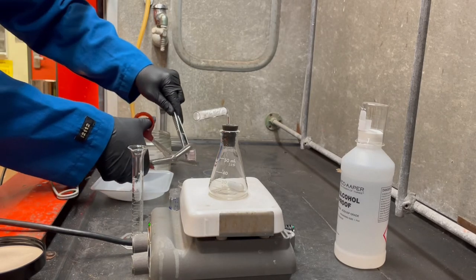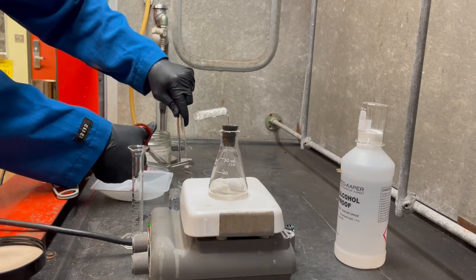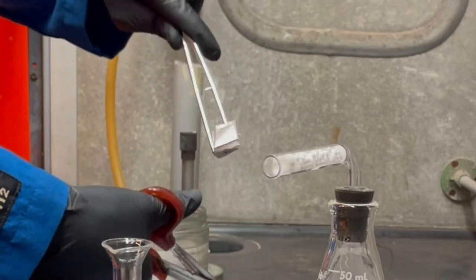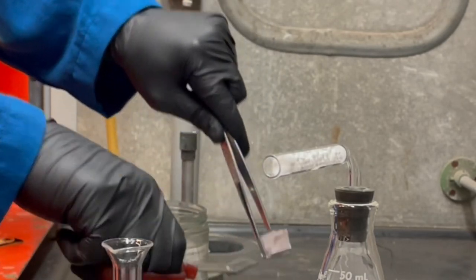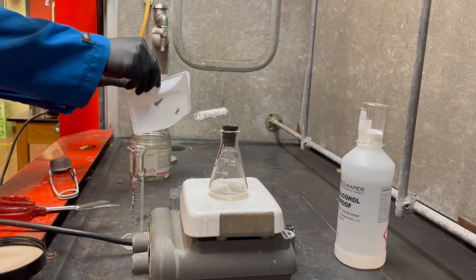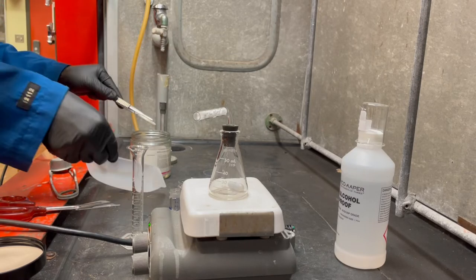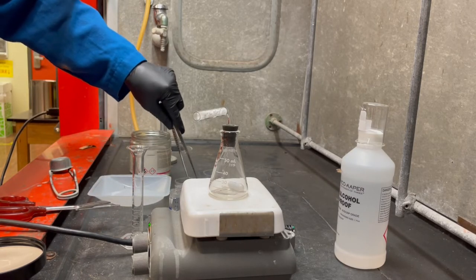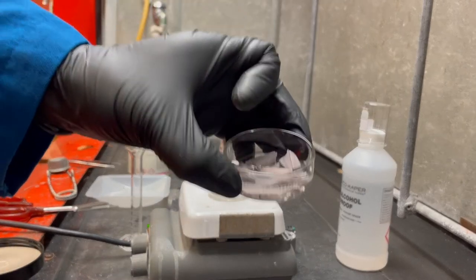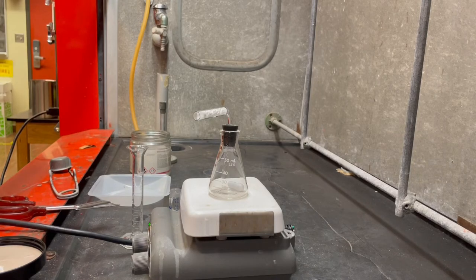So the xylenes are a hydrocarbon. They're actually an aromatic compound, and they have, oh, check this out. Did you see that? I'm trying to show you how right when I cut it off, it's still not even that shiny for very long. It's because it's getting oxidized so quickly in this humid environment that might pose a problem. It might just be more of a hassle in the end, but we'll deal with it.